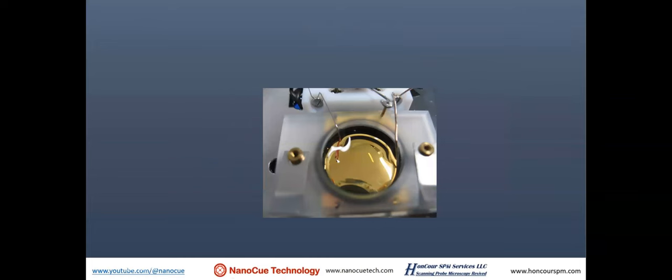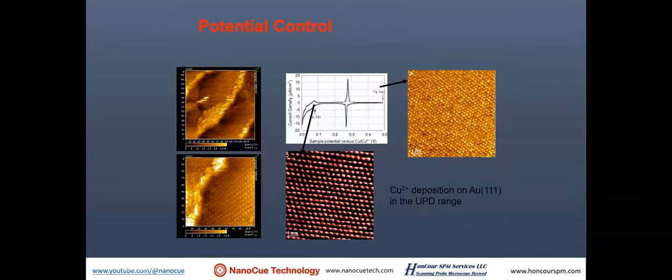This is the construction of an electrochemical cell. This is a single layer deposition of copper on the surface of gold, which caused the atomic lattice to change from 2.9 angstrom to about 5 angstroms.